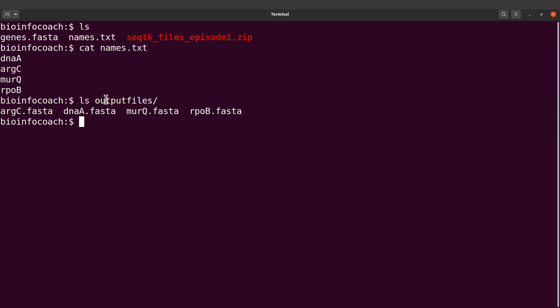At the end of the day, we are going to get something like this for each of the names. What we are going to do is write a batch script which will contain a loop, and the loop will take each of these names and extract the corresponding sequence from this file, then save to a separate output file. That's what we are going to do in this tutorial.